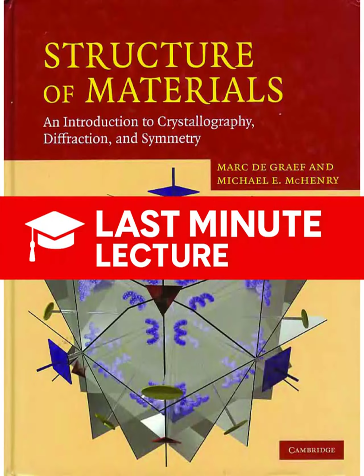Today, we are taking a massive leap forward in your understanding of materials science. We really are. If our previous dives focused on the theoretical blueprints of crystals, all those beautiful lattices, symmetries, and unit cells, this deep dive is about the experimental powerhouse that lets us actually measure those atomic blueprints. That's right. For you, the learner, this is the essential bridge. We are focusing entirely on X-ray diffraction, specifically Chapter 11, Geometry, which explains how the measurement works. So this is the how-to guide.